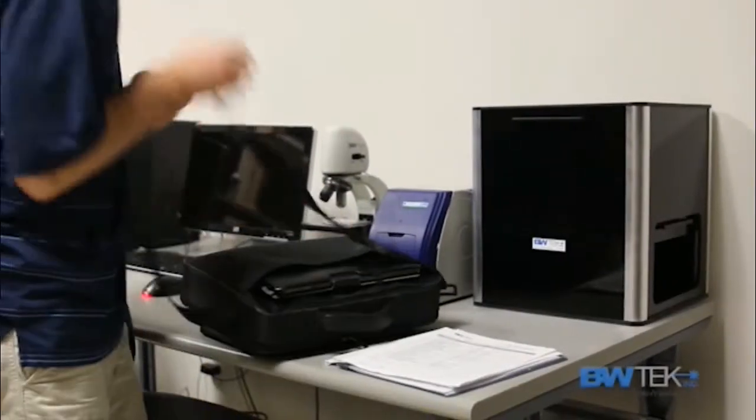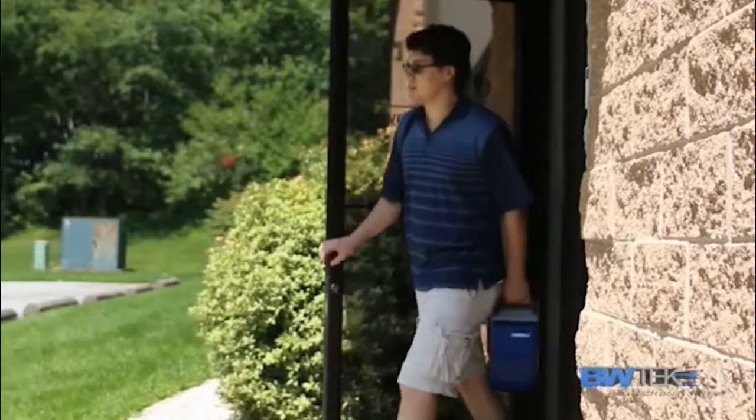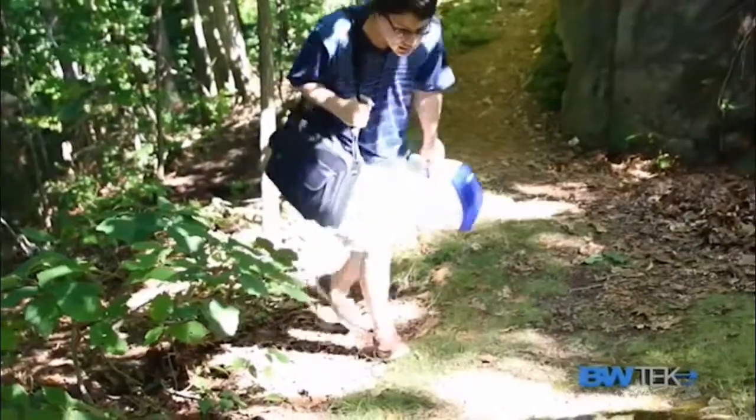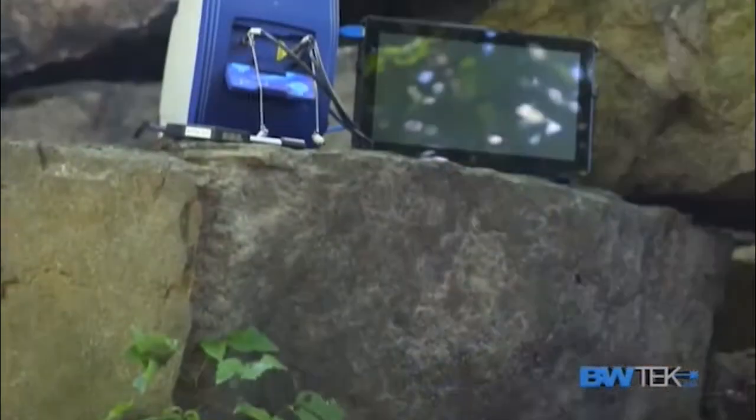The iRamen series from B&W Tech is our award-winning line of portable Raman spectrometers and sets the standard for portable Raman instrumentation. Compared to bulky and immobile benchtop systems, our iRamen instruments provide users a mobile, lab-quality research instrument that offers similar performance at a fraction of the cost.